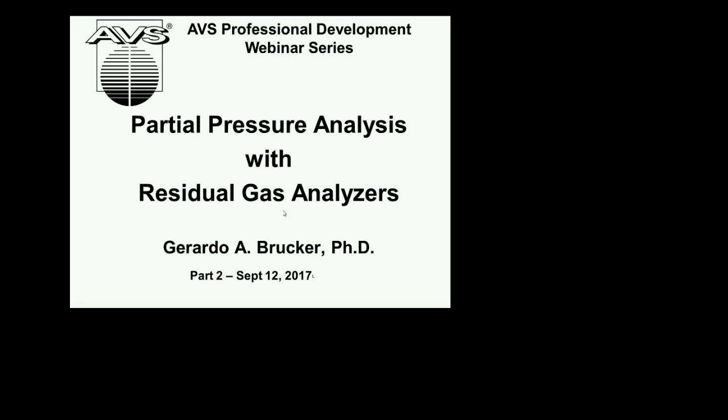and also how to do residual gas analysis. I took a look at the questions that were posted on the chat, and it looks like probably the best thing to do is to start with residual gas analysis. So the assumption here is we are going to go after the people that are using the RGA connected directly to a vacuum system.